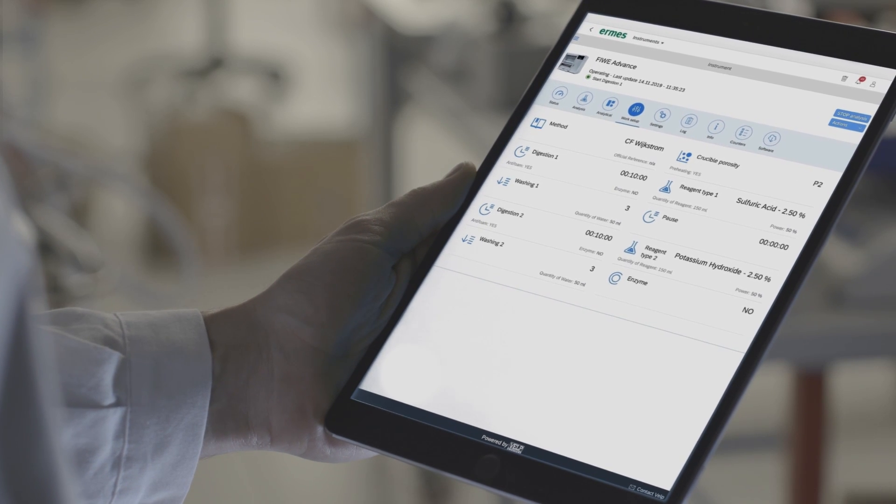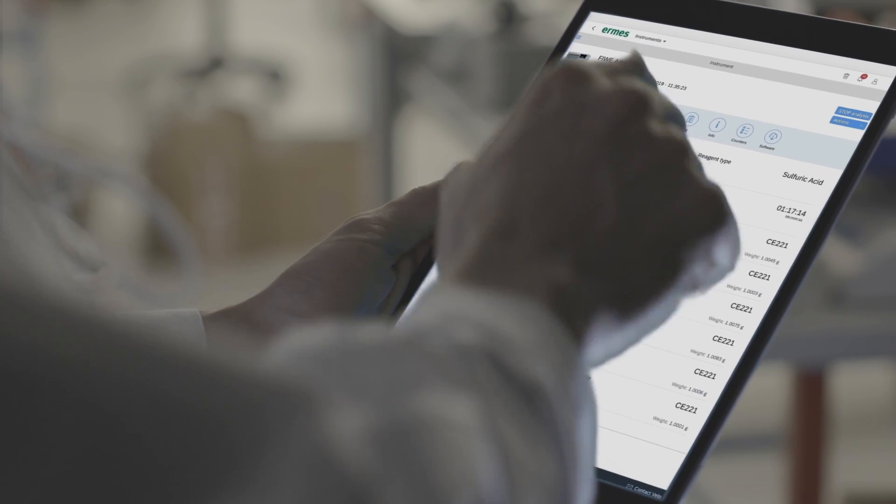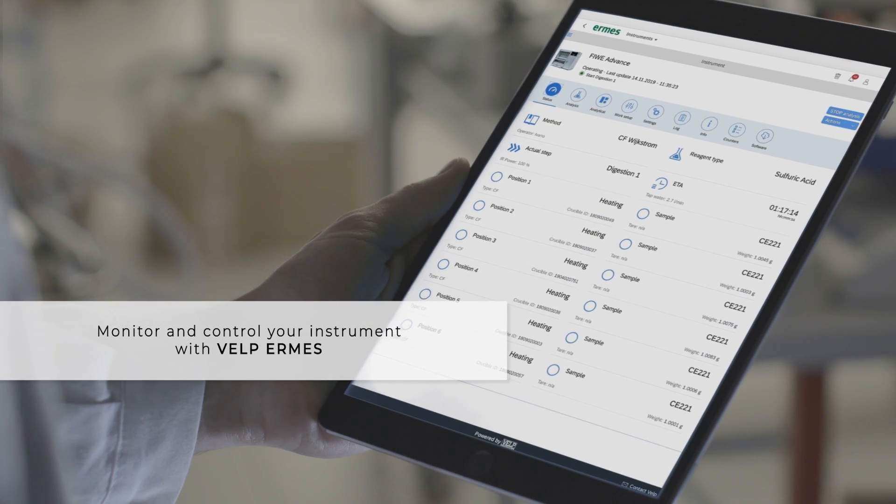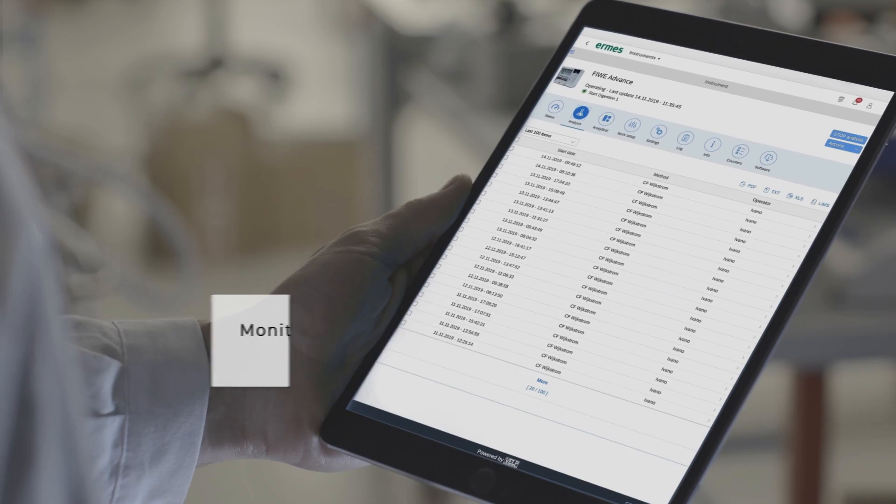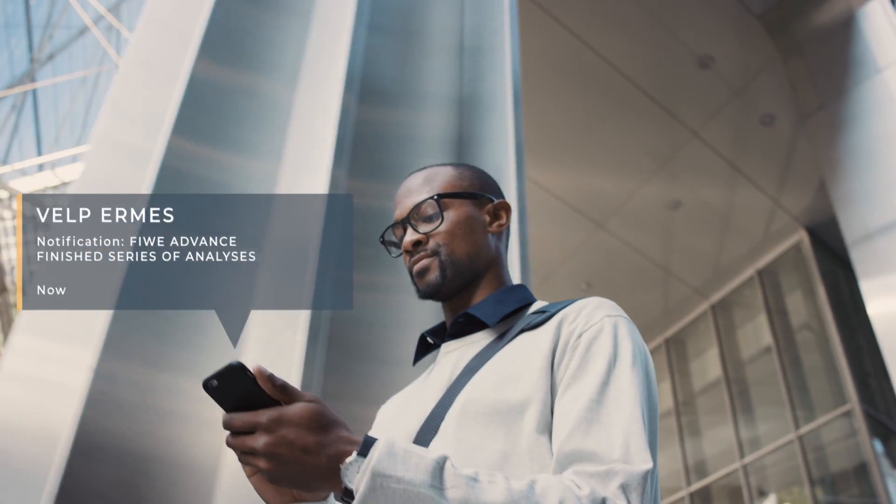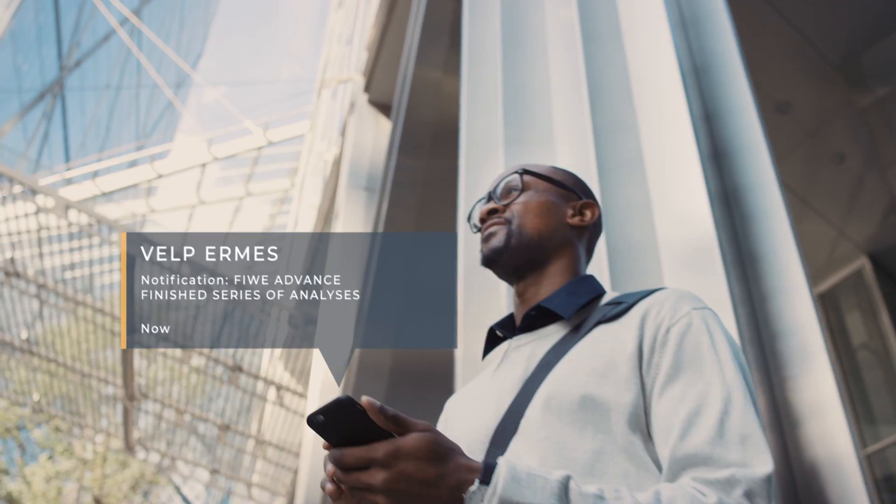To benefit from enhanced service, connect your Feeway Advance to the VELP Hermes cloud platform to monitor and control the instrument anytime, anywhere. Access your database from PC, smartphone, and tablet.